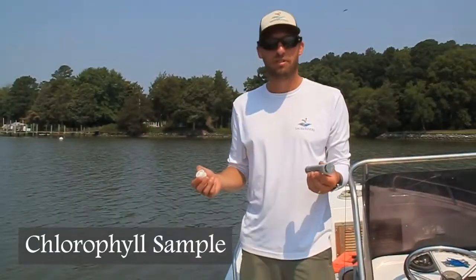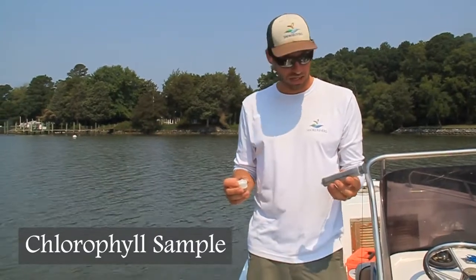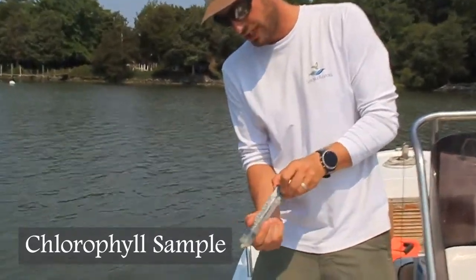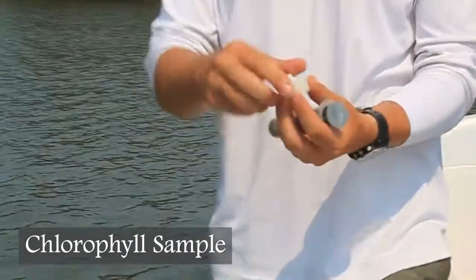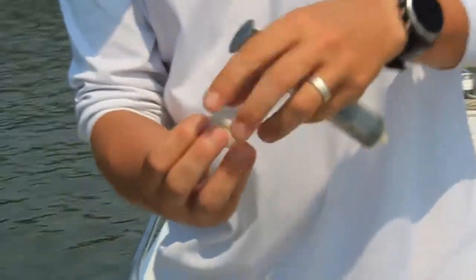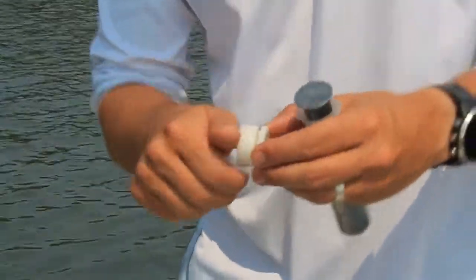We're going to collect a chlorophyll sample, and like the nutrient sample, we're going to send this to the lab for analysis. So what we have here is a plunger that helps us extract a certain amount of water from the river, and then in this little capsule here is a filter. And it's actually the filter that we want to use to send to the lab for analysis.